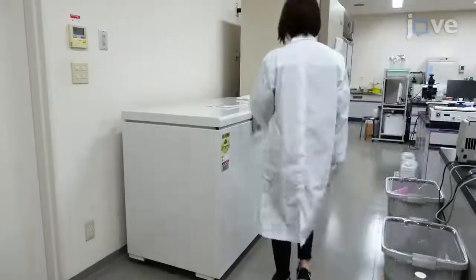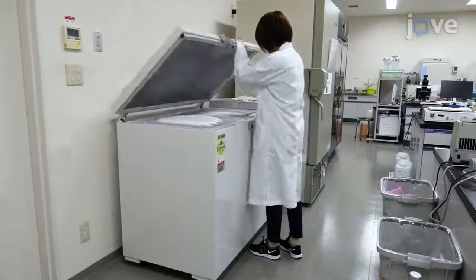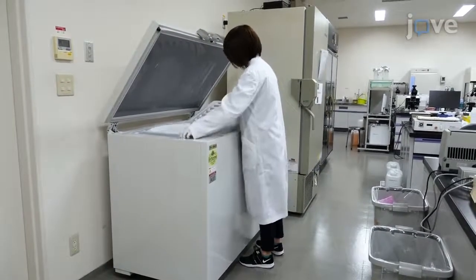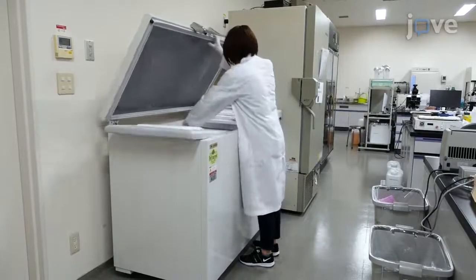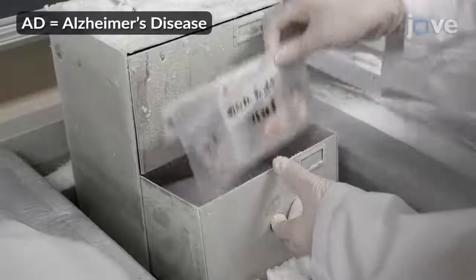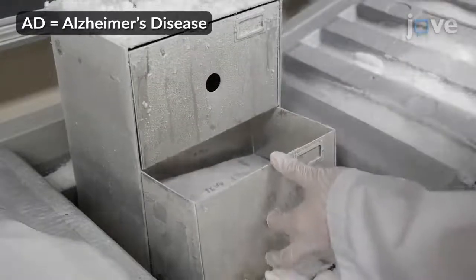Obtain human cortical specimens for IMS from brains that were removed, processed, and stored at -80 degrees Celsius within 8 hours post-mortem. Take the brain specimen from the occipital cortex of AD patients and age-matched controls.